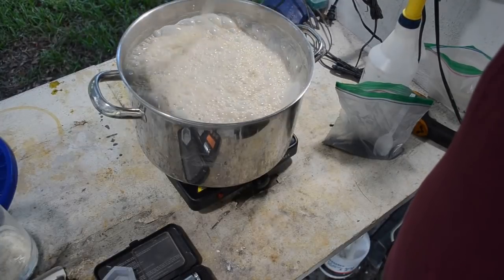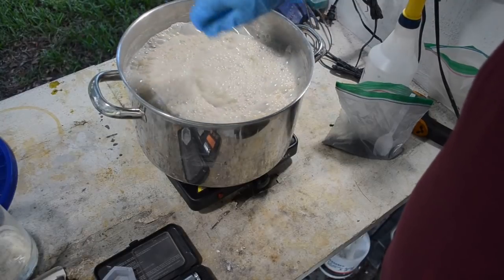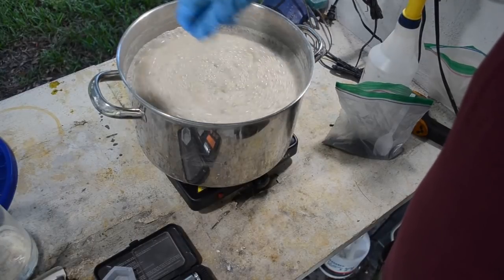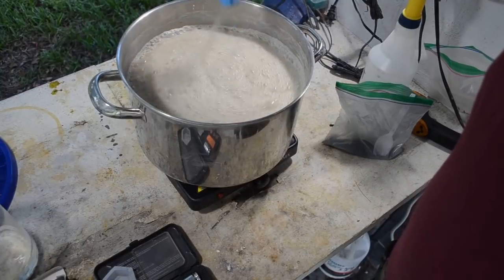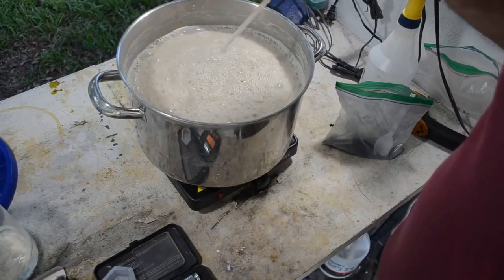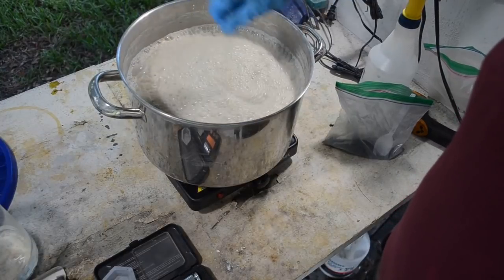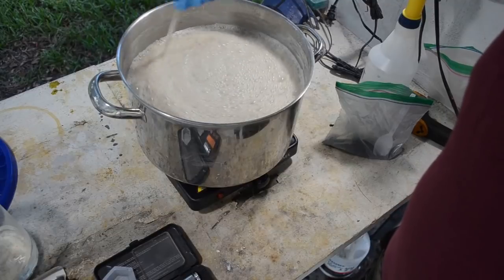Okay, the bubbling is subsiding. It's good. So what I like to do at this stage, Eco-Goldex says it's going to take about 4 hours or so for the zinc to settle. And I believe it, because the liquid's very gassy right now. It's just full of gas, and it's going to buoy up those small particles of zinc and small particles of gold that are forming on the zinc. It's going to take a long time for that to settle.